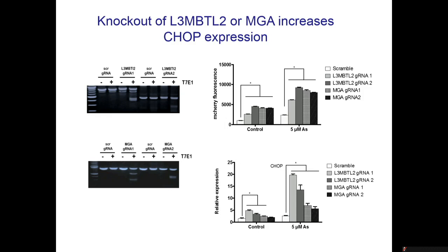This is a very quick, easy way to tell you that the CRISPR worked. Later on, we got antibody. We also show that the gene is knocked out. So you can do that, as you can see. So essentially, this is a reconstitution. You take the original chopped mCherry cells, remake these knockouts, and see whether you can get the phenotype.